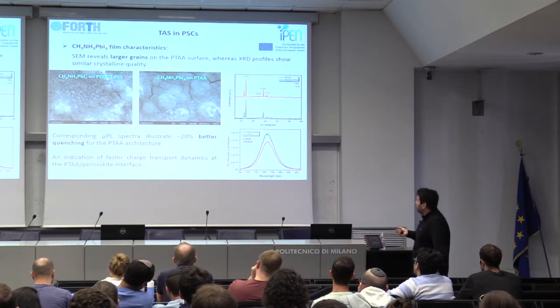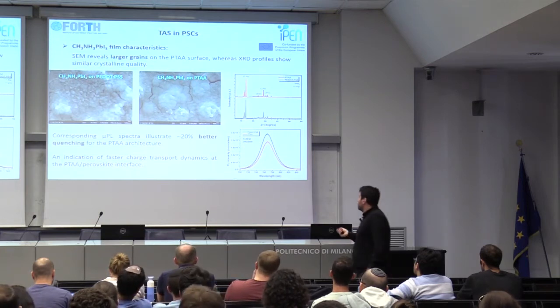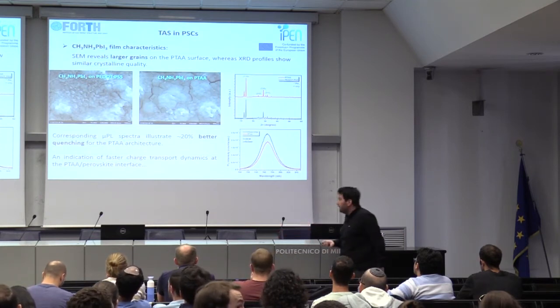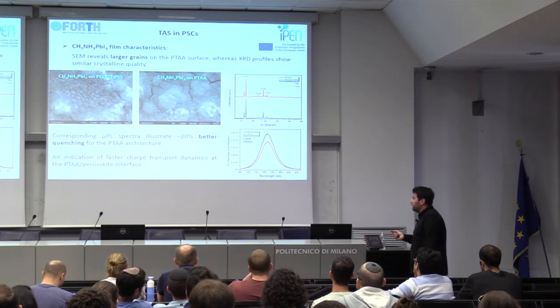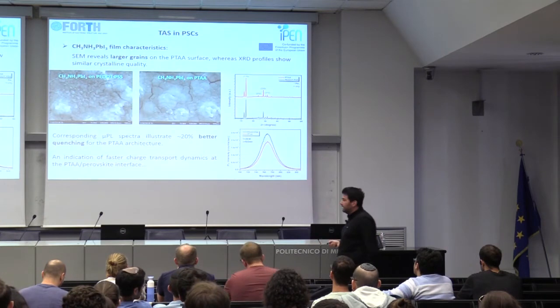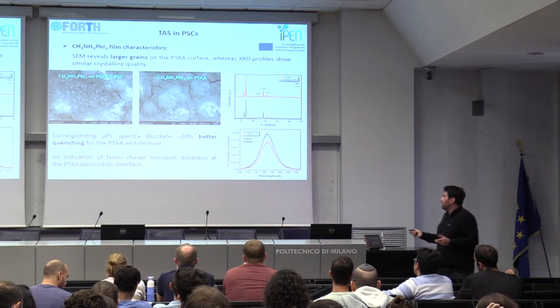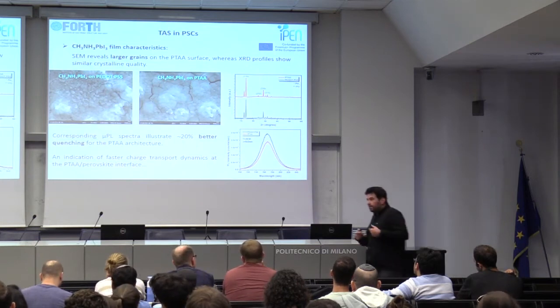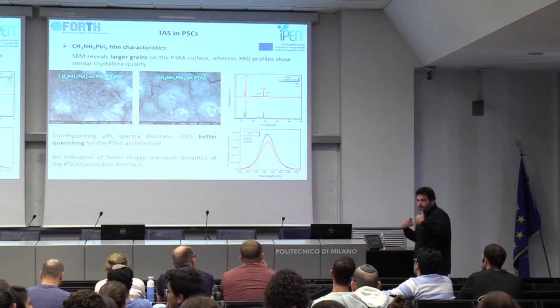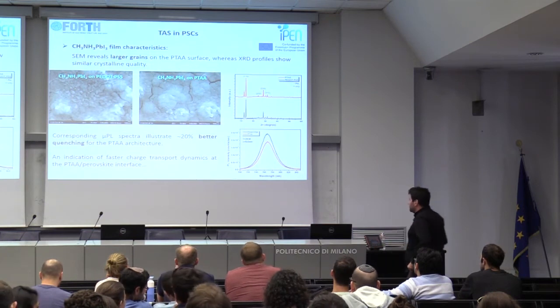And you can see here on the right that the lead iodide perovskite, which is on top of the more hydrophobic PTAA polymer, exhibits considerably larger grains when compared to the one which is grown on the PEDOT:PSS surface. And usually larger perovskite grains means that they will be of better quality and they will perform better when it comes to power conversion efficiency of the photovoltaic device.